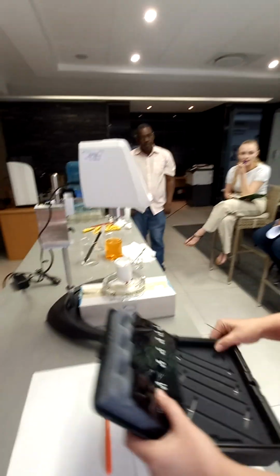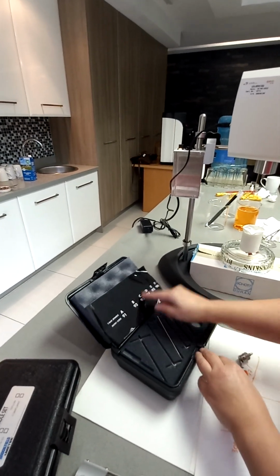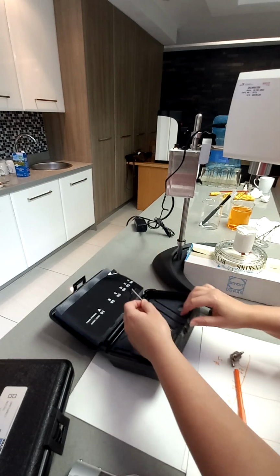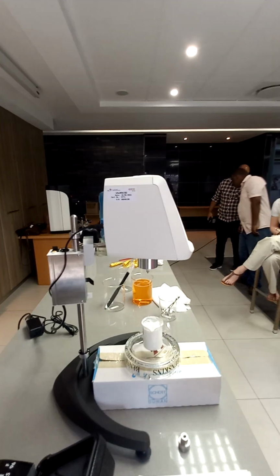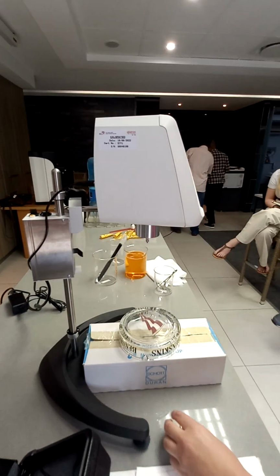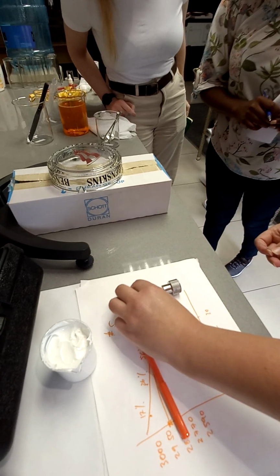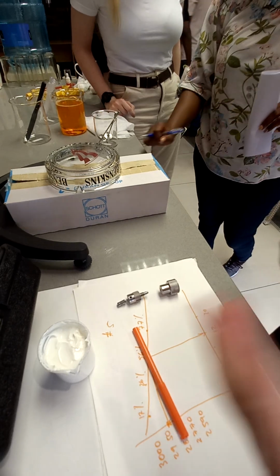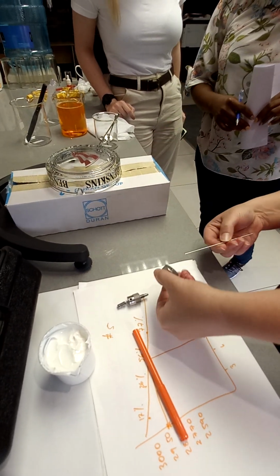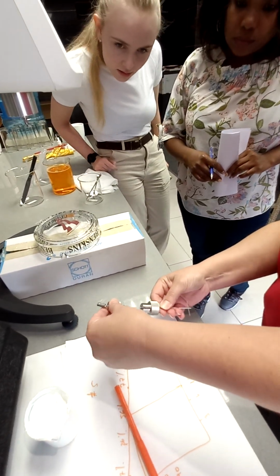I just want to see the spindle numbers. So this one is number 93, the third one. And then to attach, I want you just to come closer so you can see. This is really easy. You've got these two parts. But if you check the manual, if you forget how to do it, and there's videos, or I can come here again. So you'll stick this through the hole there. Stick that in there.